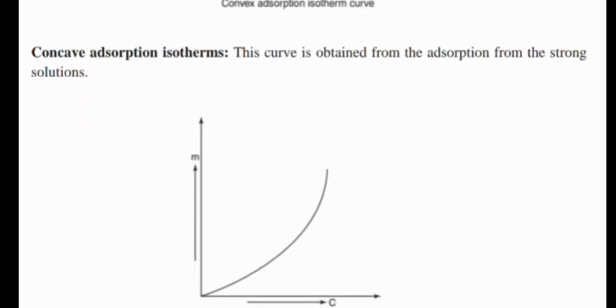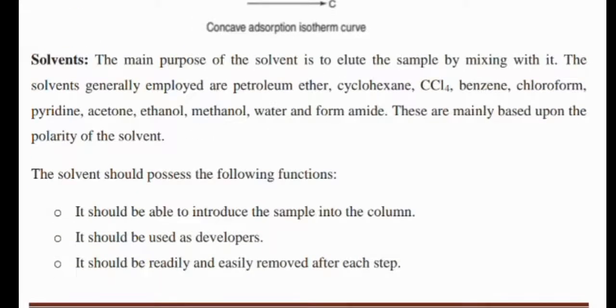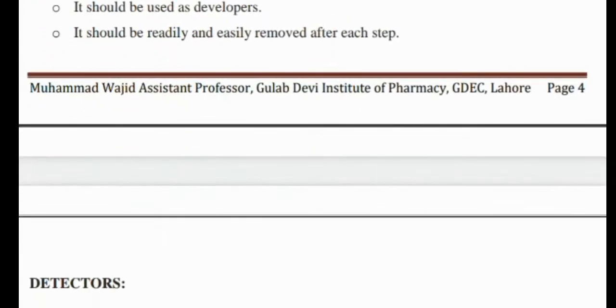Further, we have the solvents, and they possess the following functions. It should be able to introduce the sample into the column. It should be used as a developer. It should be readily and easily removed after each step.